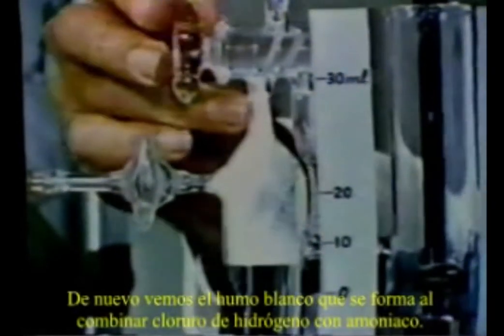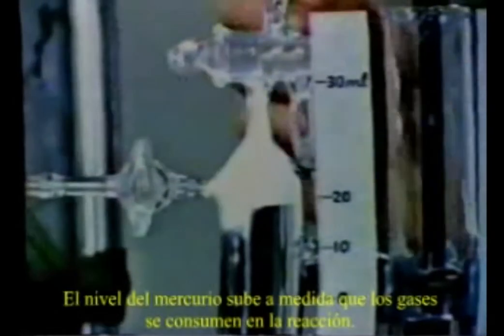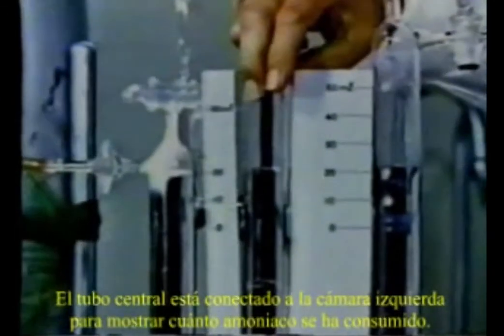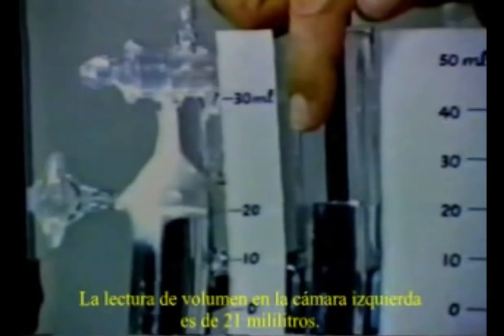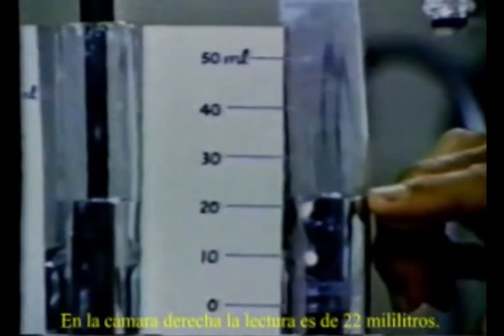Again, we see the white smoke as the hydrogen chloride combines with the ammonia. The mercury levels rise as the gases are consumed. Now the pressures on both sides have been adjusted to 1 atmosphere with the leveling bulbs. The center tube is connected to the left chamber to show more clearly how much ammonia has been consumed. The reading in the left chamber is 21 milliliters. In the right chamber, the reading is 22 milliliters.